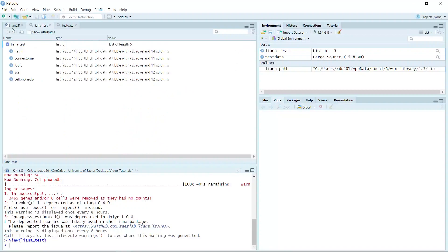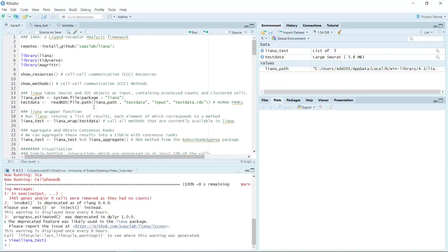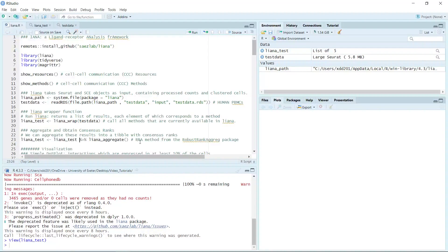So we ran the wrap function and can see the cell-cell communication pathways from each method. Then the package provides an aggregate function. We can aggregate and obtain a consensus rank, because a specific ligand receptor pathway may have different rankings by different methods. We can aggregate the results from the five methods into a table with consensus ranks. This aggregate function uses the RRA method from the robust rank aggregate package.